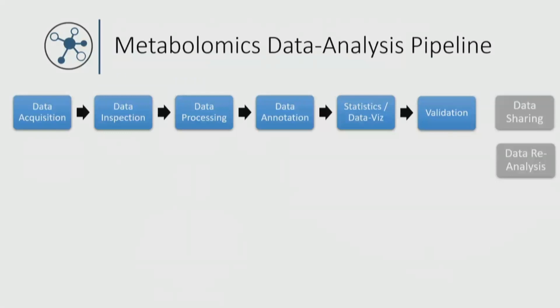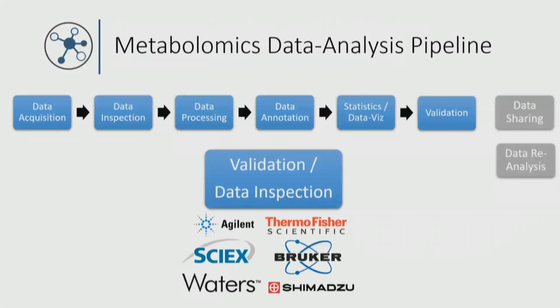So I think this validation step at the end is a bottleneck. Different vendor formats and different non-open source software that you eventually have to buy really prevent going back to that original data and verifying the results. And here it's not only the actual visualization of the file. There are numerous software solutions to open LCMS data if it's in a public format, but also simply the fact that you have to download data to visualize it. And with growing data sizes, this becomes a time-consuming factor.